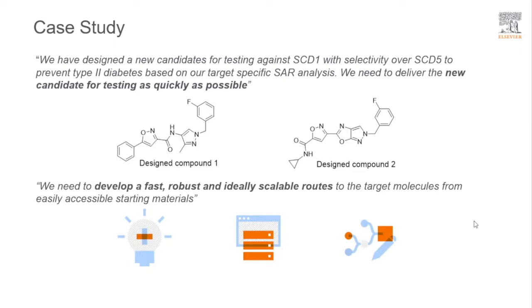To develop a fast, robust and ideally scalable route to the target molecules from easily accessible starting materials, we need to take help of Reaxys Predictive Retrosynthesis.